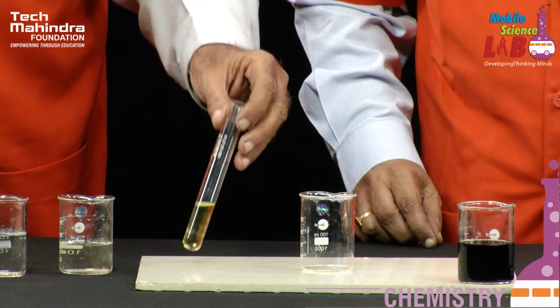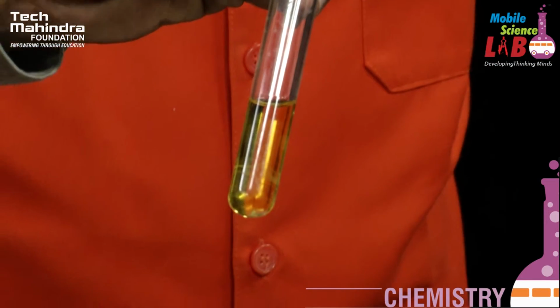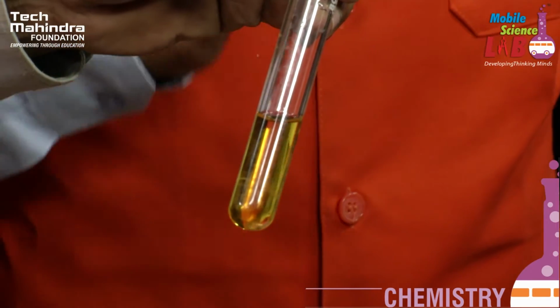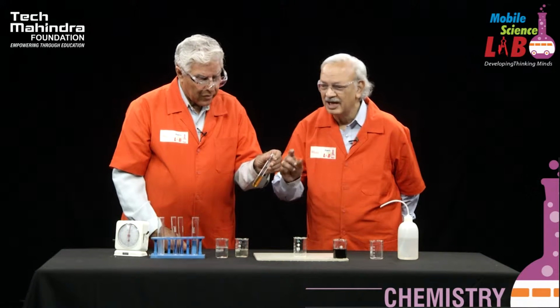That's it. Iodine color. You can see the formation of a yellow color, which is slowly becoming more and more intense. The first reaction is potassium persulfate plus iodide gives you iodine plus other ions. This iodine is the one which is responsible for our observation of this.